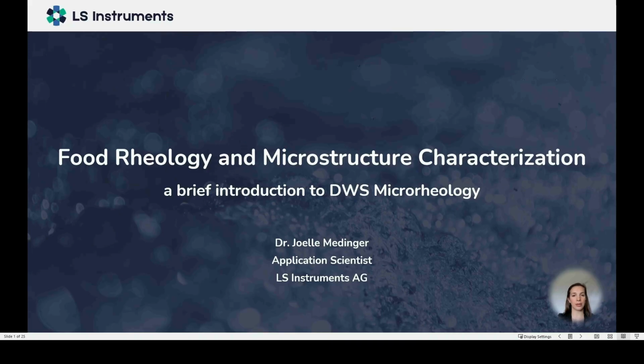Today, I'll be talking about diffusing wave spectroscopy for microrheology measurements, with a particular focus on applications in food.